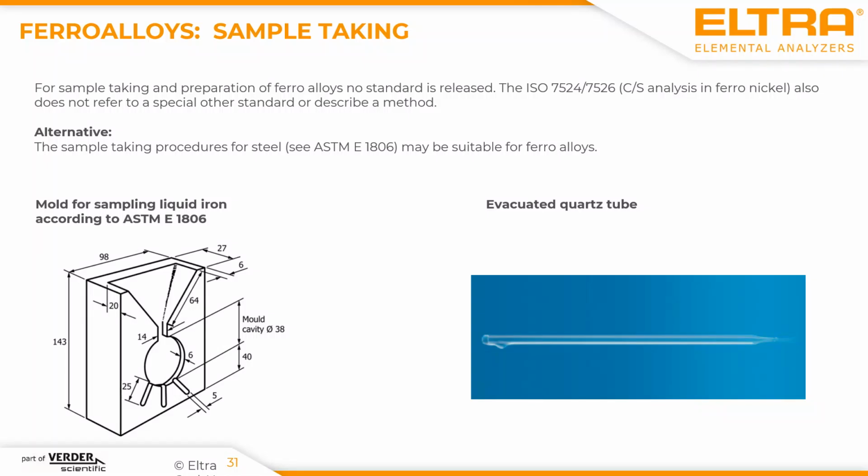This does mean they use a special sampling unit for taking liquid iron, for example, to prepare the samples for a spectrometric measurement and also for gas analysis. Maybe this is also suitable for you to take samples from the ferroalloy.